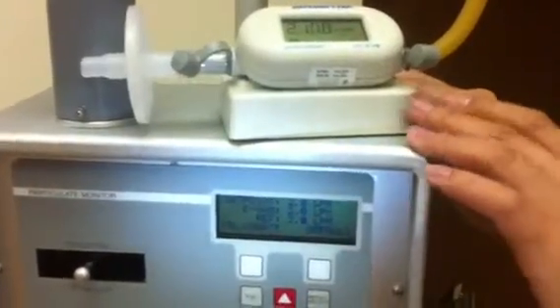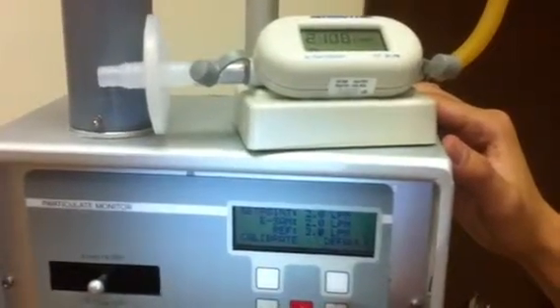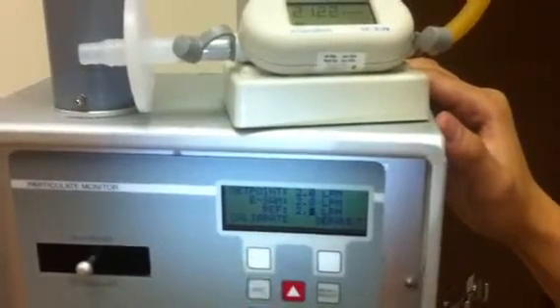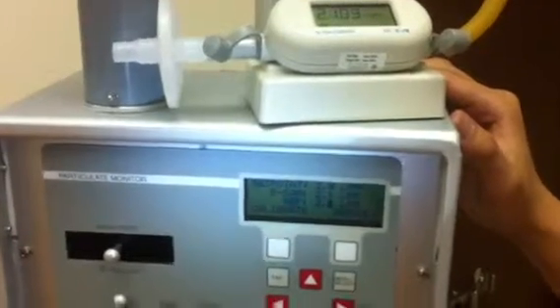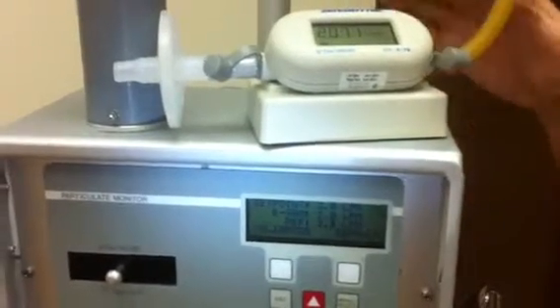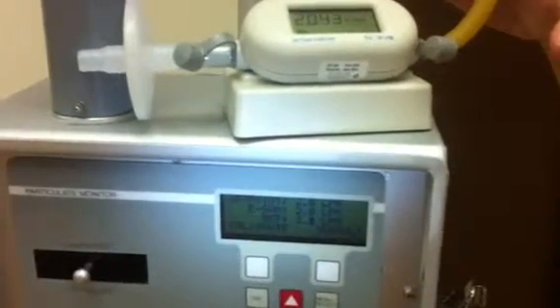Now we can see the calibrator is showing 2.1 liter per minute. So now we come to the e-sample. We set to 2.1 liter per minute in the reference. Then we press calibrate. And we can see that the flow meter is showing the reading going down nearly to 2 liter per minute.